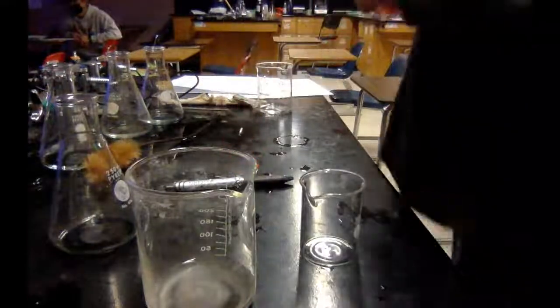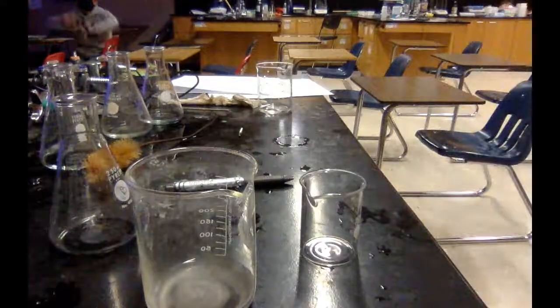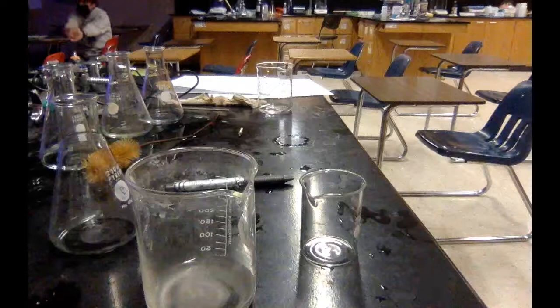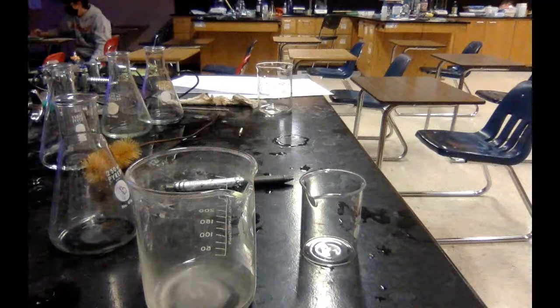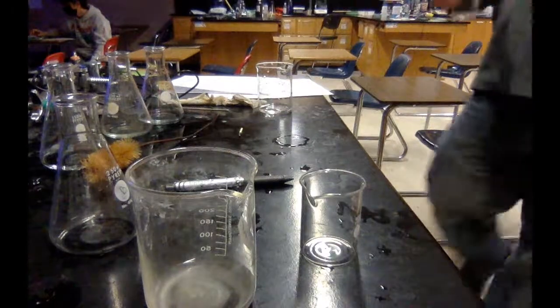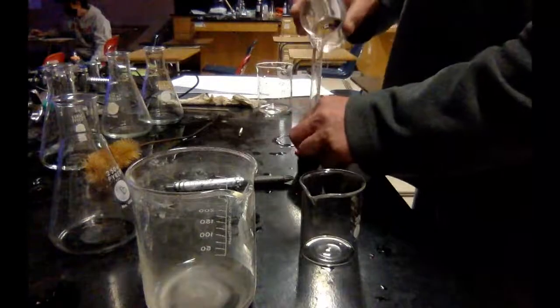Right? And that's HCl. That is the thiosulfate. HCl is over here on this table. Oh, thank goodness, you're not just pouring it. And for all of these, we need how much of the HCl? 10.